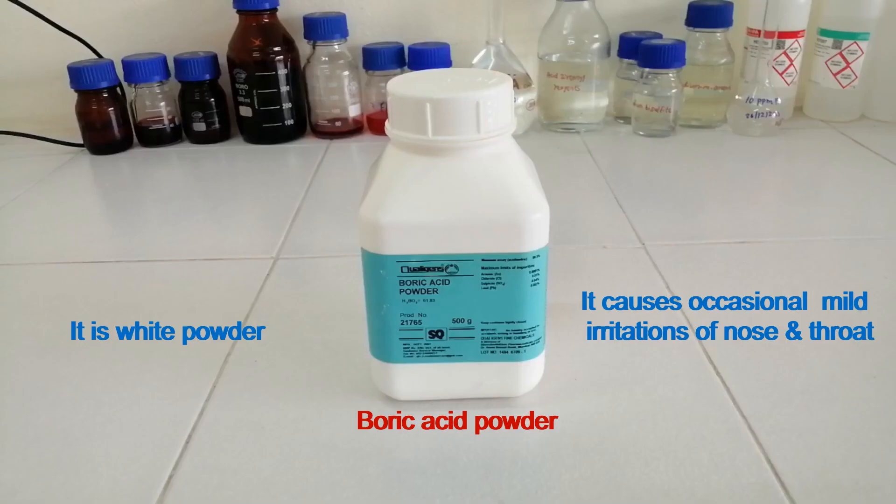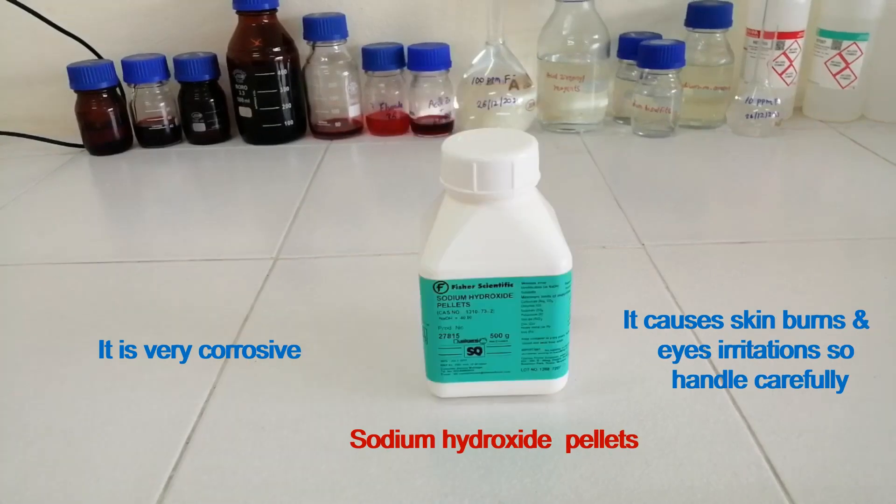This is boric acid powder. It is white powder. It causes occasional mild irritation of nose and throat. This is sodium hydroxide in pellets form. It is very corrosive. It causes skin burns and eye irritation, so handle it carefully.